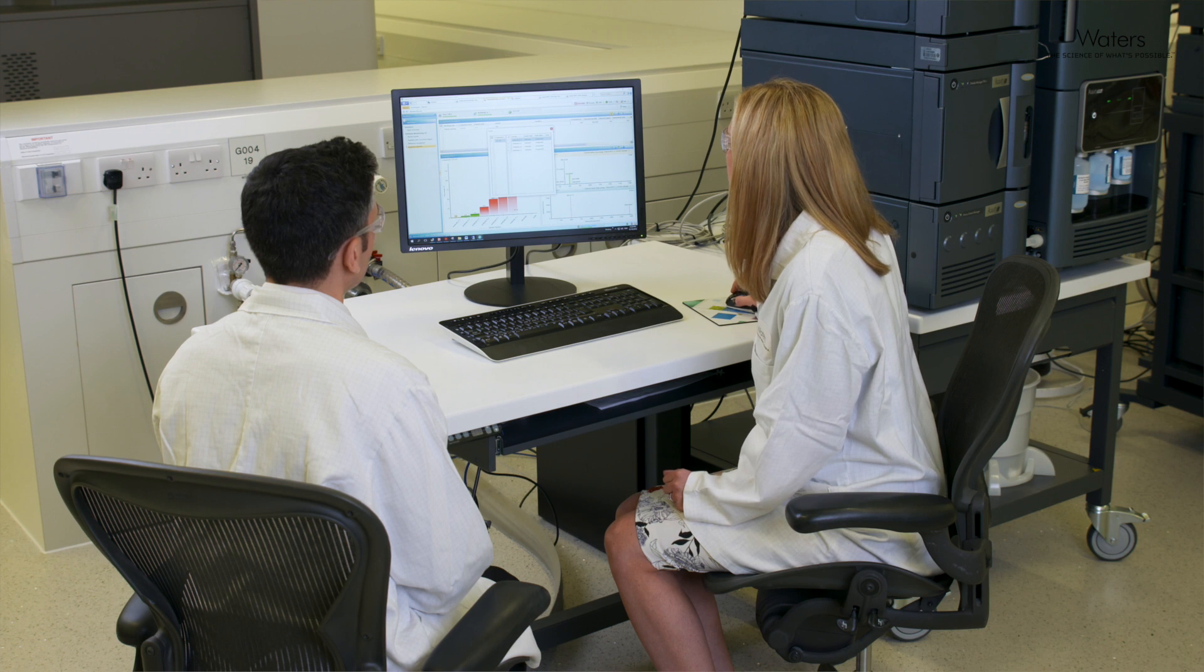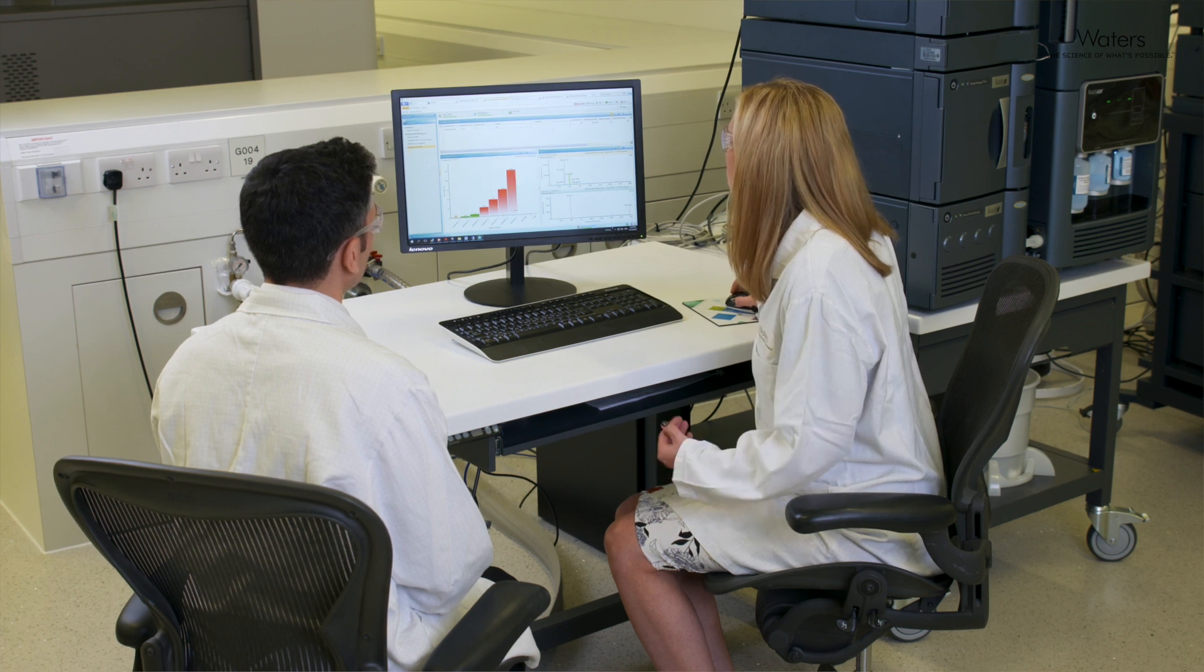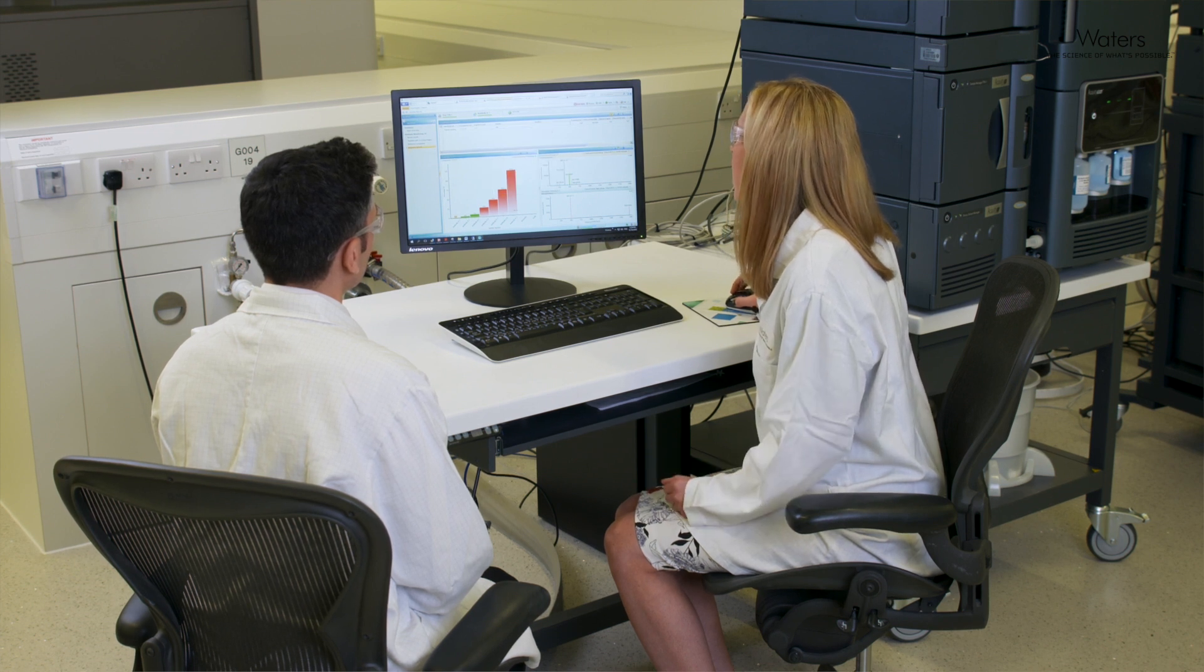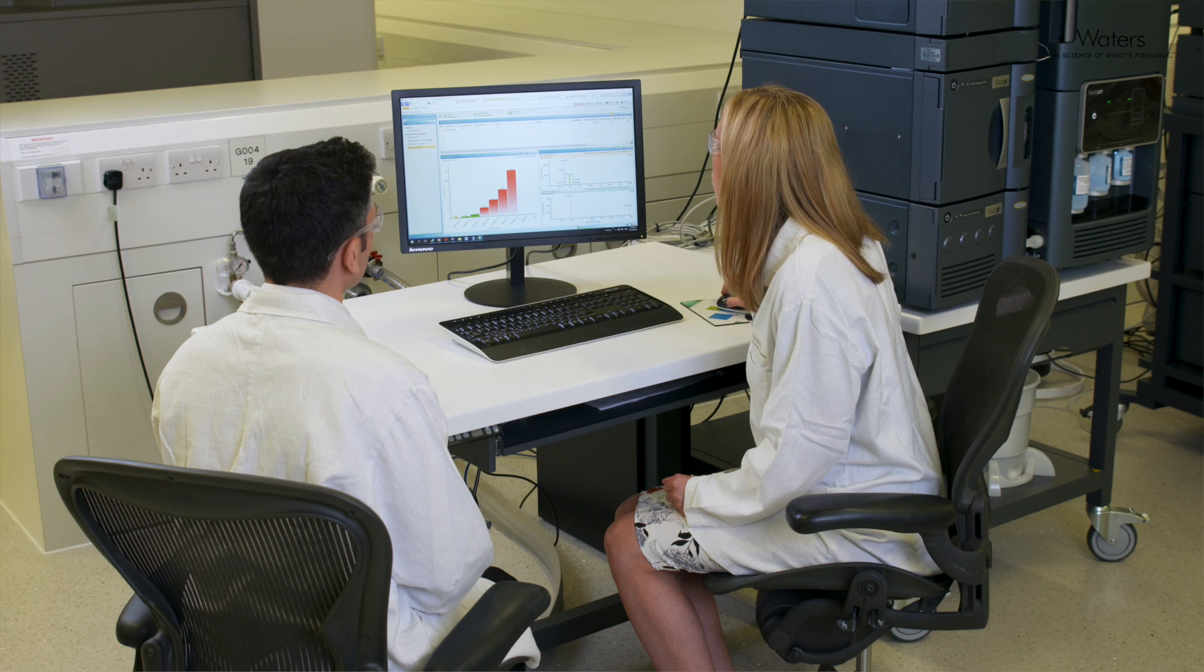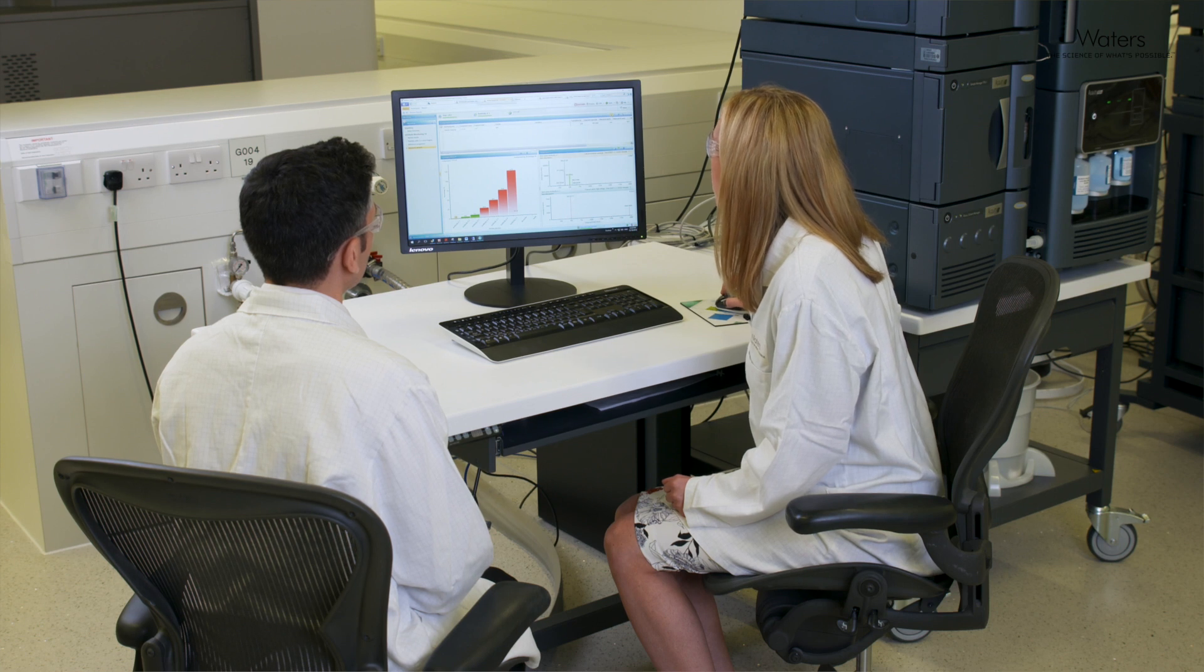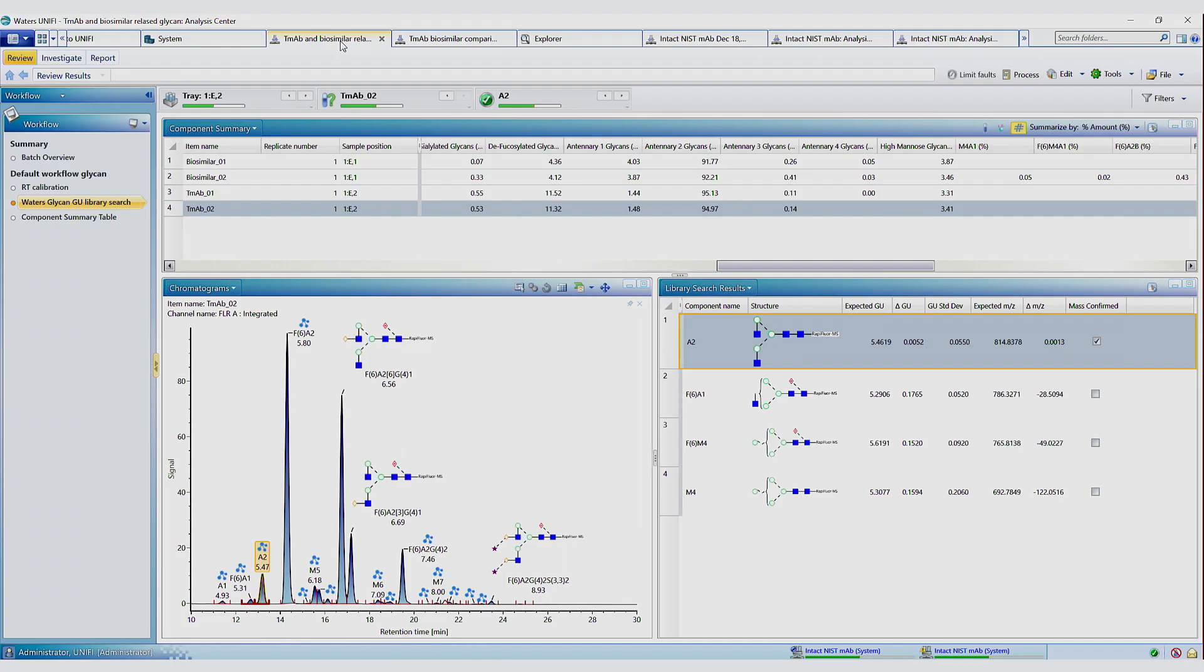So this is peptide mapping. We also have the setup to do released glycan analysis. So I'm just going to quickly show you an experiment where we have labeled the released glycans with RapiFluor MS.